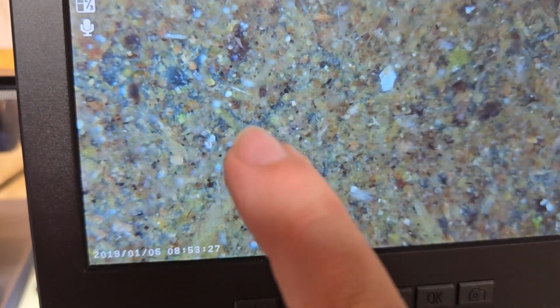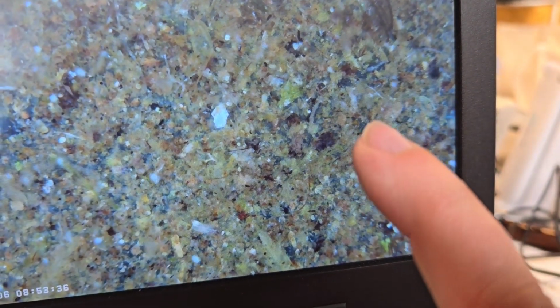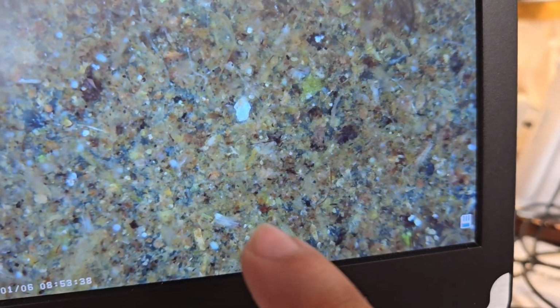The best thing to do, I've noticed, is just move whatever you're looking at to the position that you want it to be in, let it settle down, and just wait for movement. Even though you can't really see all that great because of all the plant matter and dirt and stuff here, you can still see it moving around quite a bit. There's definitely a lot of worms in here that are just spazzing out and wriggling all around. There's another area right there. Wow, there's a lot of these worms in here.